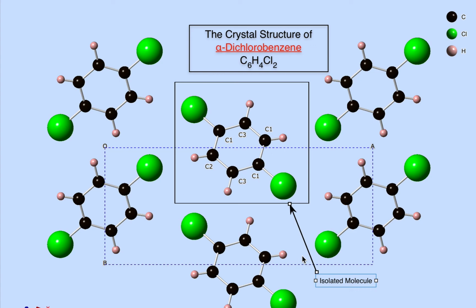So that's a quick summary of annotation objects in CrystalMaker: atom labels, bond labels, and the annotation overlay.